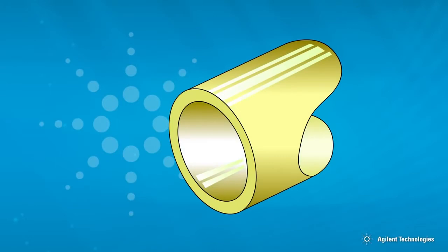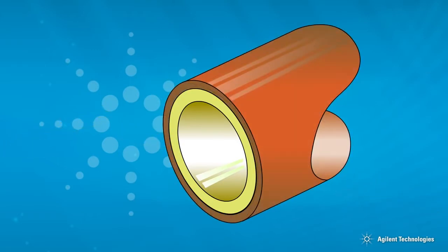Capillary columns are made out of fused silica glass, which is drawn to a narrow ID tube in very long lengths. Fused silica is a pure form of glass that is very inert and exhibits almost no interaction with the sample components. Uncoated fused silica is very fragile, so it is coated at the factory with a high-temperature polymer called polyimide. This results in a flexible piece of tubing with greater mechanical strength and flexibility. The inside layer of the capillary column is the stationary phase. This is where the GC sample separation occurs.